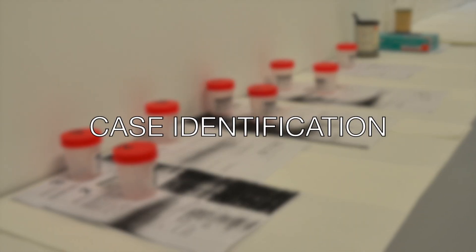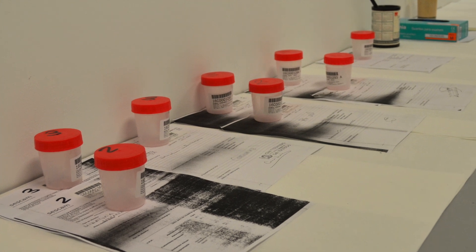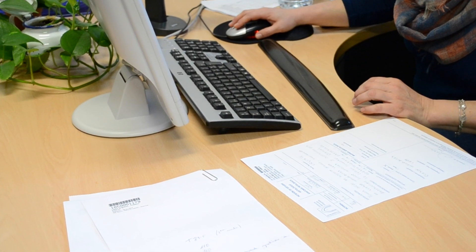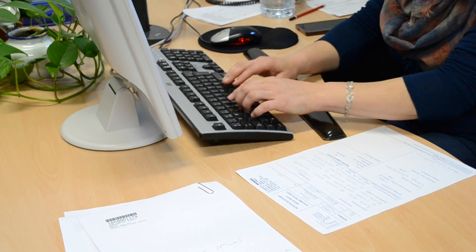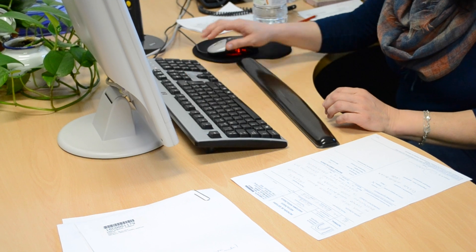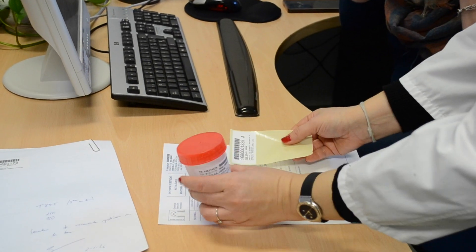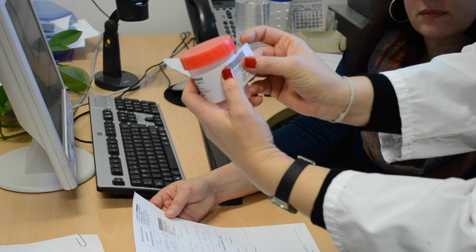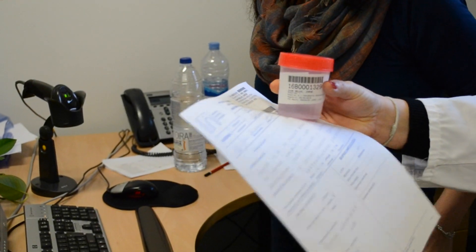Before continuing with the process of histological tissue sample preparation, we must address the process in the secretariat. This point is very important. Case identification. First, for proper case identification, it is essential to check the personal data. Second, the registration and finally the number of pathology, that is, the biopsy code. To this end, once we receive the samples in the pathology department, we must carefully verify specimen labeling and patient identification. That is, to check the patient data on the pot matches the flyer request of the clinician who took the sample. In addition, some stickers are obtained with a biopsy code to stick them in the flyer request as well as on the pot.